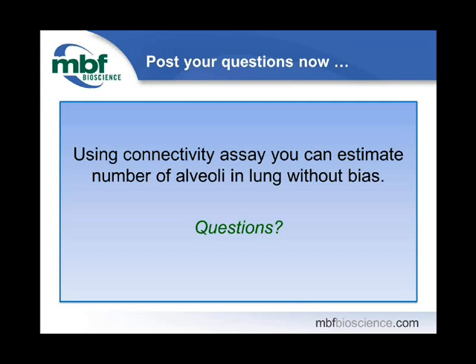And actually, what we just used in our software, we had images that we previously acquired. So you can use the program with the microscope. You would have a motorized stage, you would have the slide on, and you could do work that way. But if you just have images to work from, you could do that as well, and you can use that just as a simple workstation system. So you can certainly do it both ways.